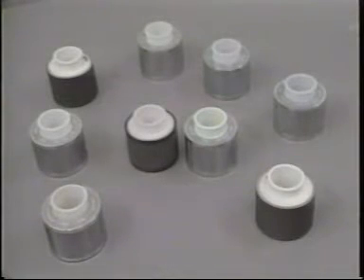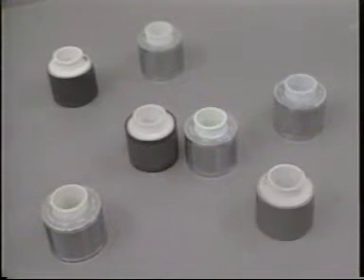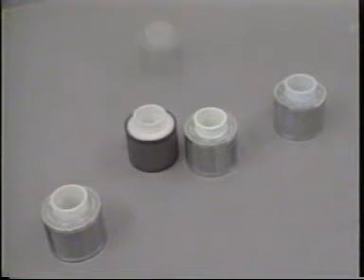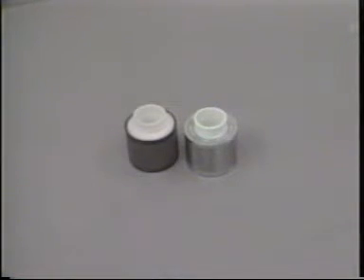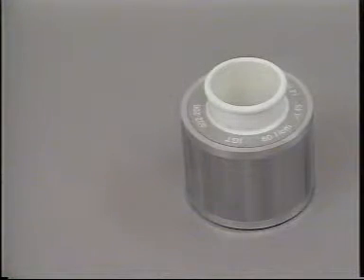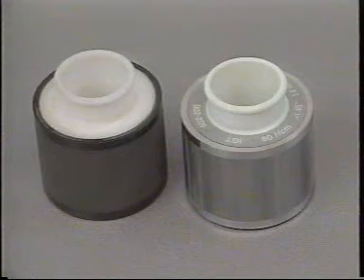There are two sorts of engraved discs with which the printing test can be made: the electromechanically copper engraved chromium plated disc and the ceramic laser engraved disc. Both types are available with several screen rulings and volumes.